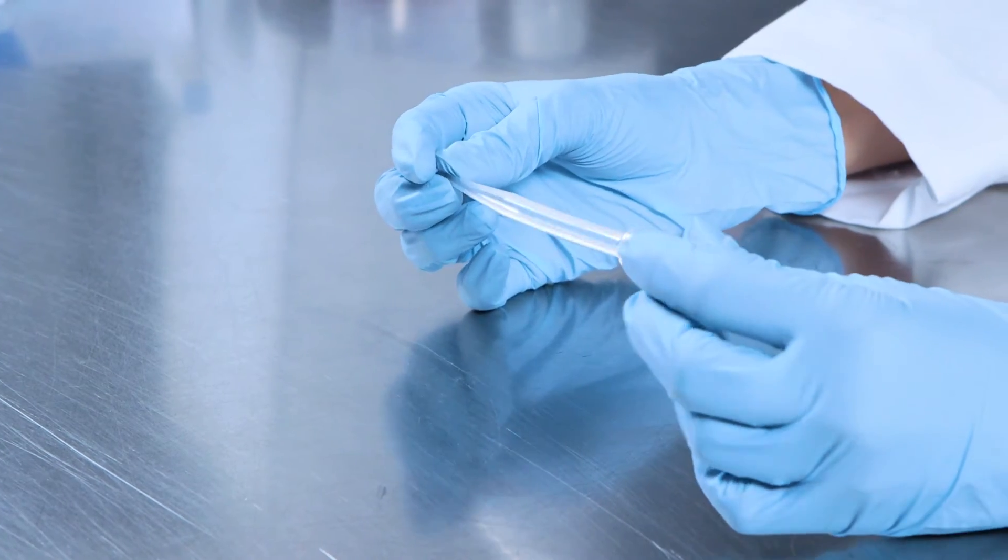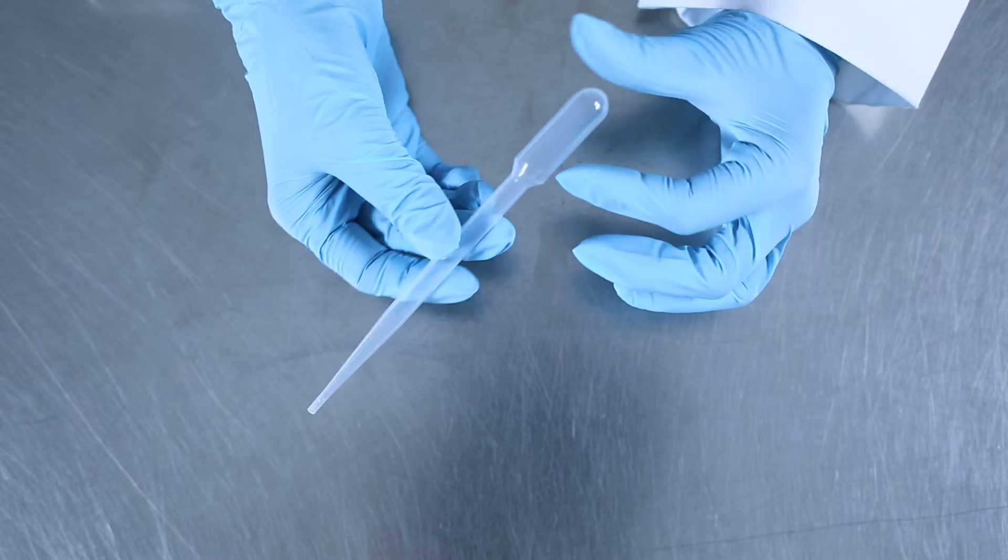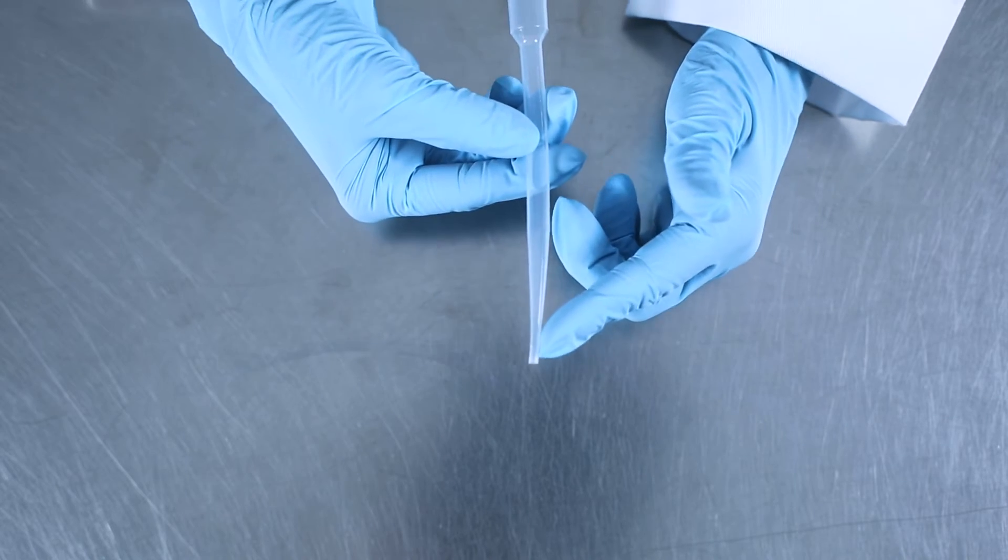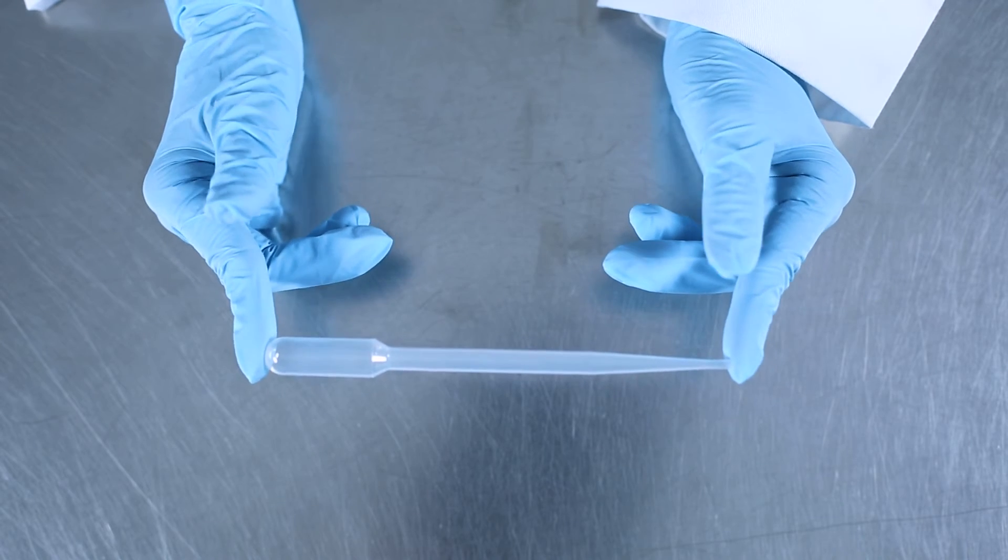We offer general purpose transfer pipettes. We call them general purpose because they can be used in many applications. The tip is about one eighth of an inch in diameter. The overall length is about four inches.